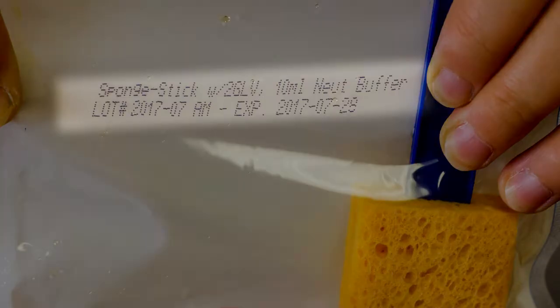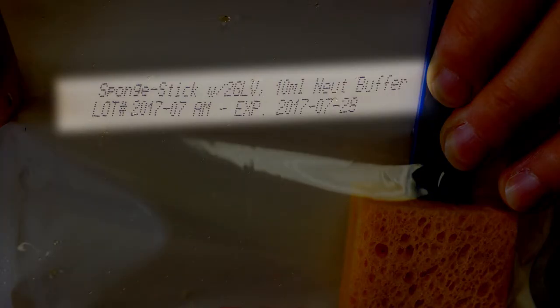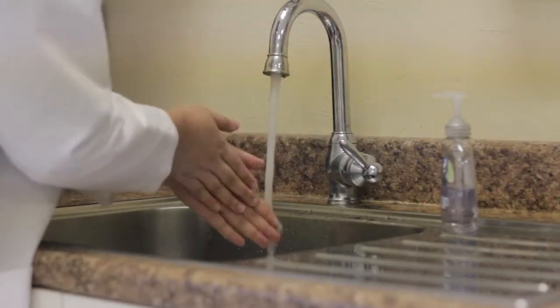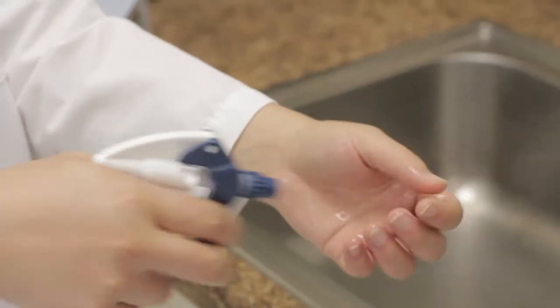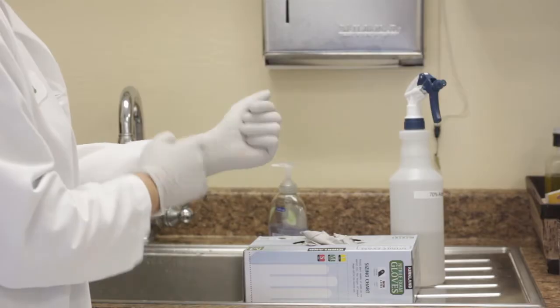Always remember to check the expiration date and integrity of the swabs and sponges before use to avoid contaminating the samples. Wash hands with soap and water, dry them with a paper towel, and apply sanitizer after hands are dry. Wear clean gloves and apply hand sanitizer to the gloves.